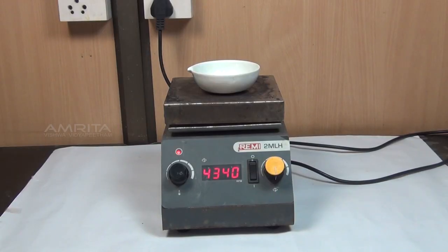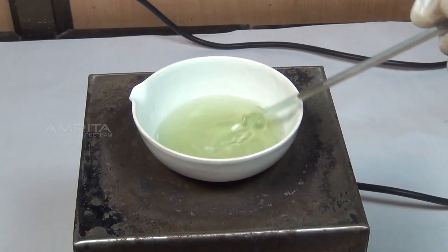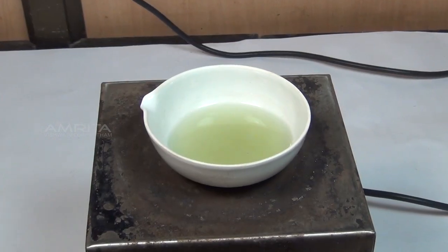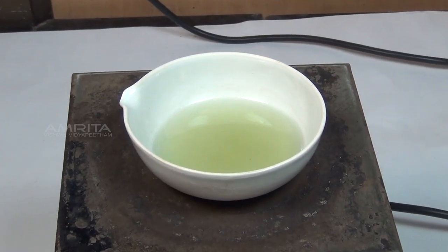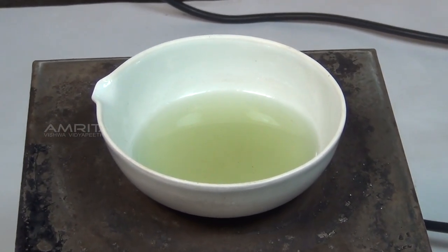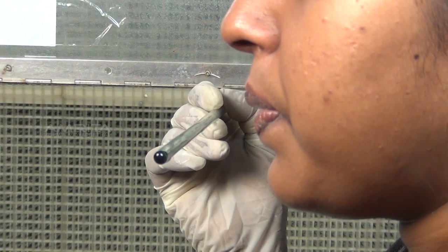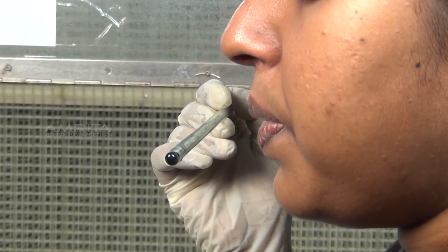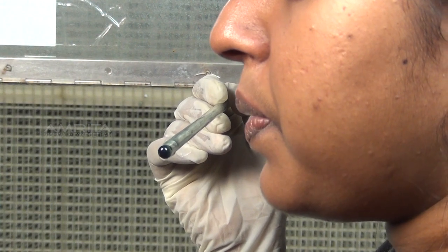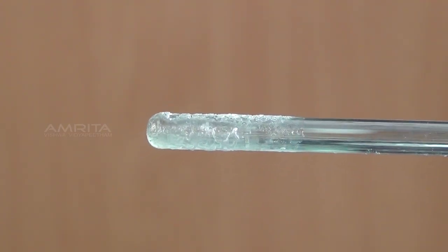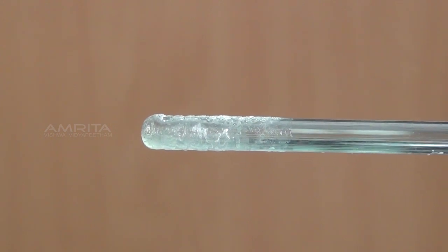Heat the solution in the china dish over the hot plate. To avoid crust formation on the side of the dish, stir the solution continuously with a glass rod. When the volume is reduced to about half its original volume, take out a drop of the concentrated solution at the end of the glass rod and cool it by blowing. Formation of a thin crust indicates that the crystallization point has been reached.